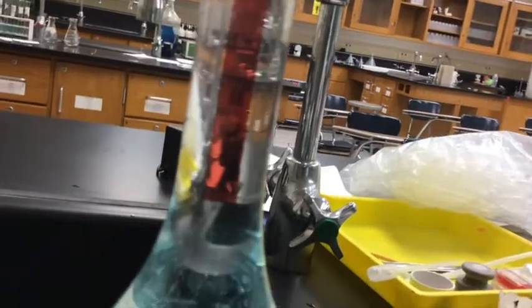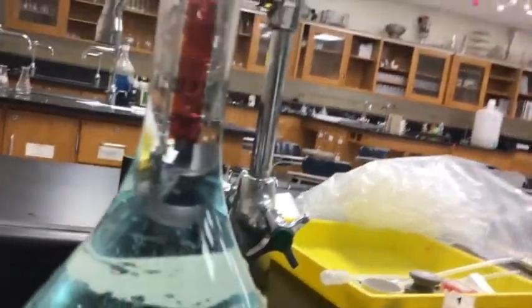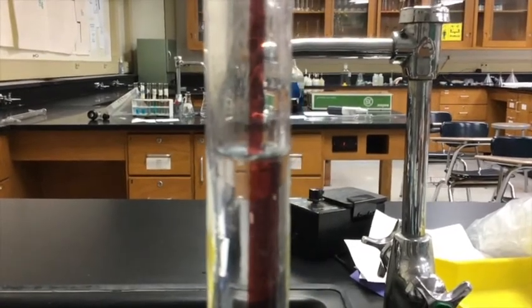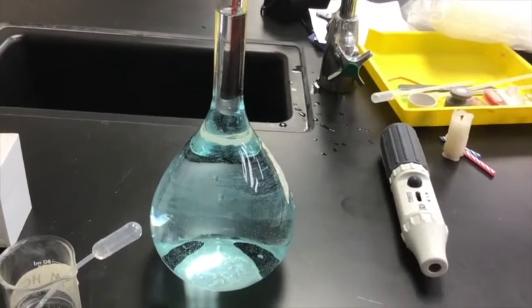Alright, so we go ahead and add that in so that the bottom of the meniscus is right there. And if you are looking right at it, it should be right at that line there. So the meniscus is right on that line. So now I have exactly 1 liter of this solution.